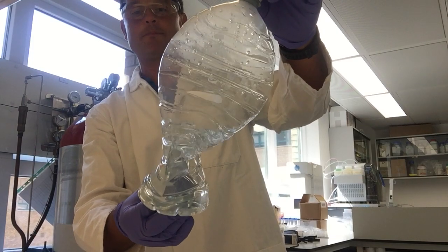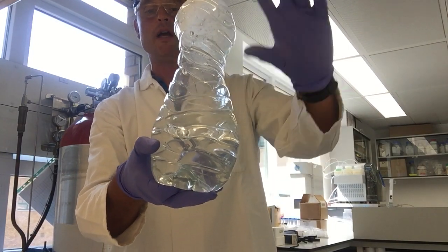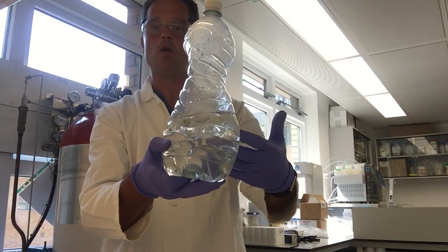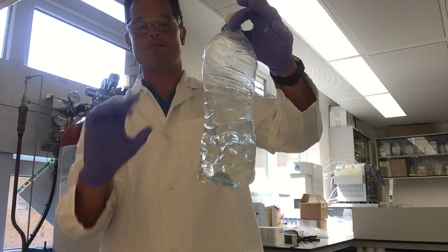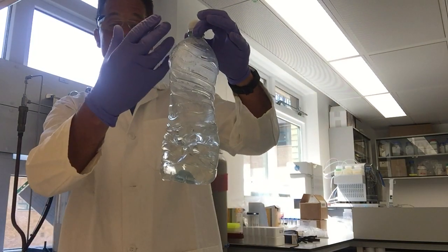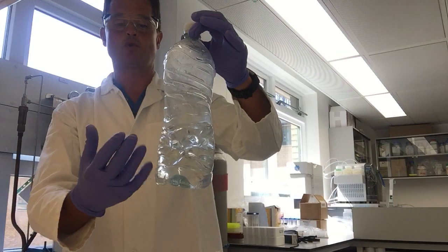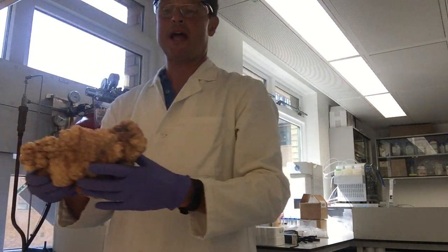So why is the bottle collapsing? It's totally collapsed. It collapsed because the space that was full of CO2, that CO2 now went into this sodium hydroxide solution. It was captured by the sodium hydroxide solution, and the CO2 is now dissolved in this solution. Hence, that produced a vacuum above, because now I have no CO2 in my headspace. All the CO2 is dissolved in this water. If I dissolve enough of this CO2 from the headspace into this water, the CO2 combines with any calcium or magnesium or sodium ion in this solution, and it precipitates as calcium carbonate or as limestone.